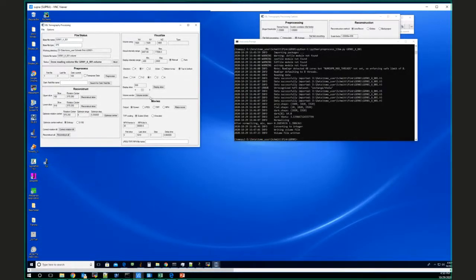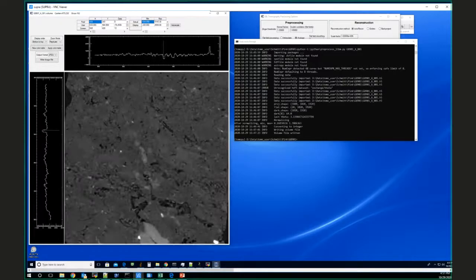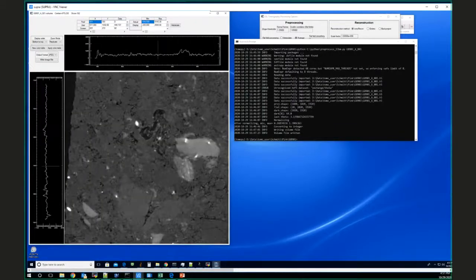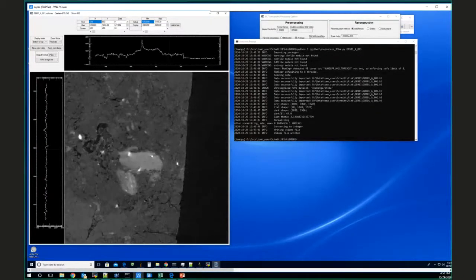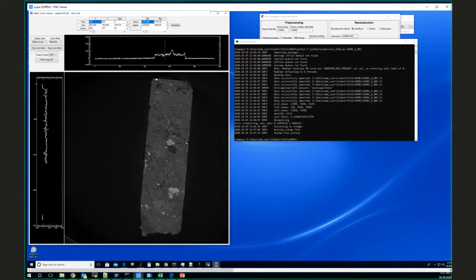I've got to go back to zoom a half here. You can see, Doug, this stuff has got a lot of real porosity in it. Yeah, it's really low velocity. I think there's a lot of alteration in it too. It would have been sitting above this really hot stuff for a long time with a lot of fluids coming through. Yeah, that's cool.